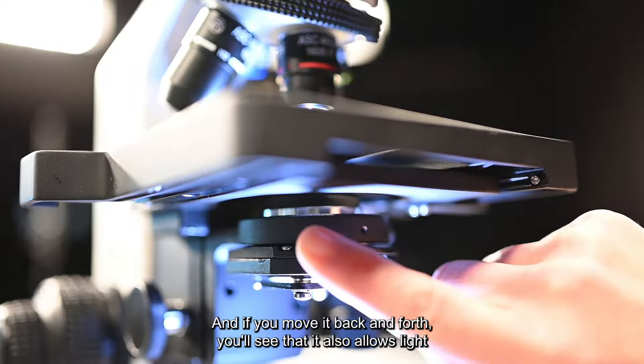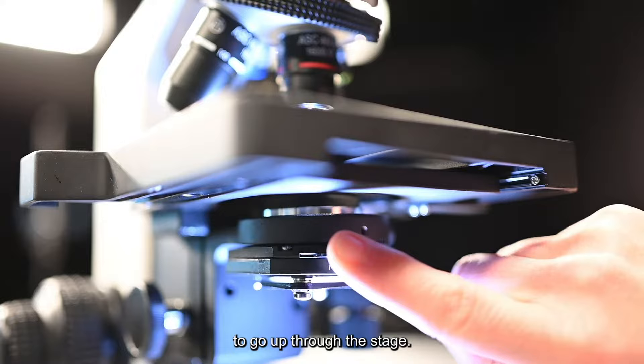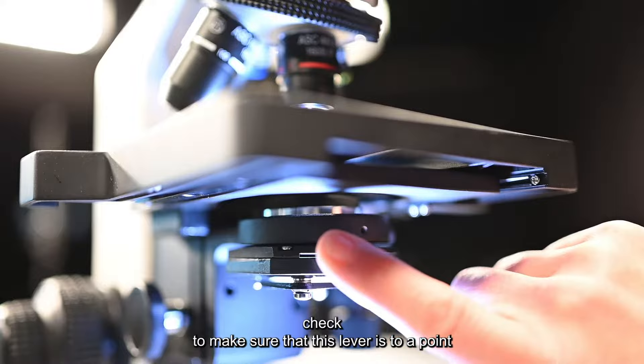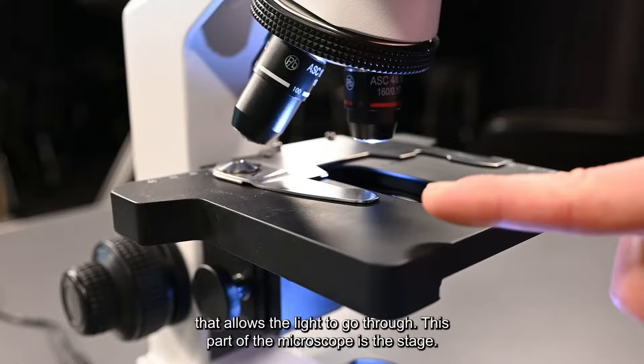Underneath the stage is a sliding part and if you move it back and forth you'll see that it also allows light to go up through the stage. If you're not getting light through your specimen, check to make sure that this lever is at a point that allows the light to go through.